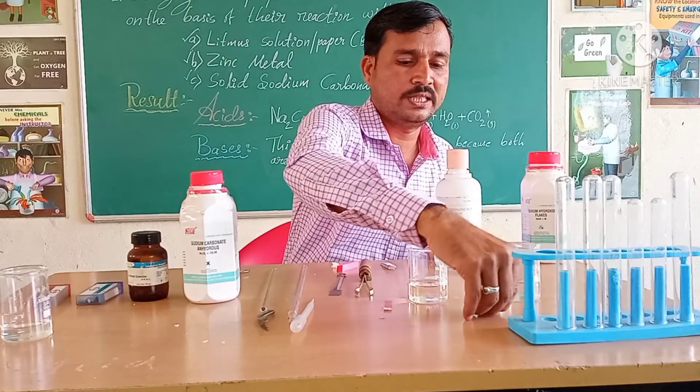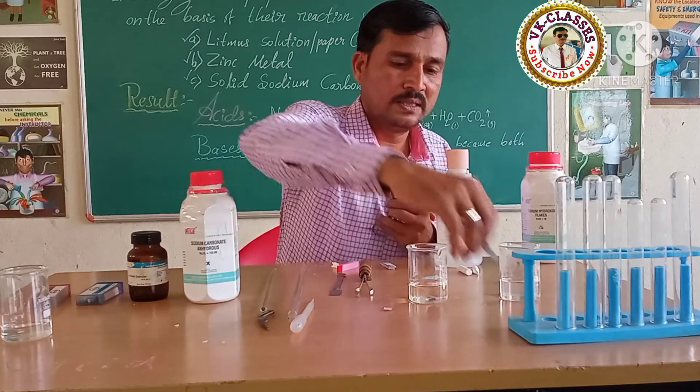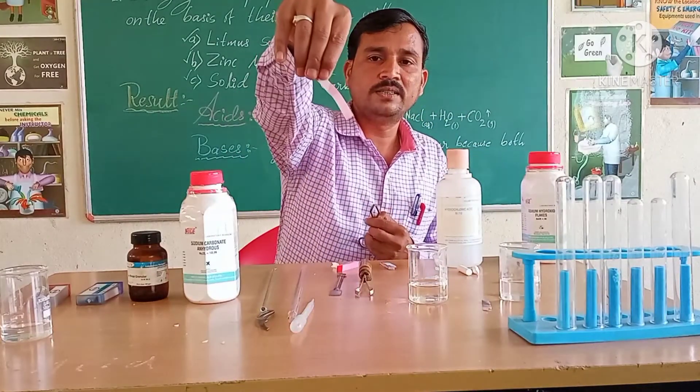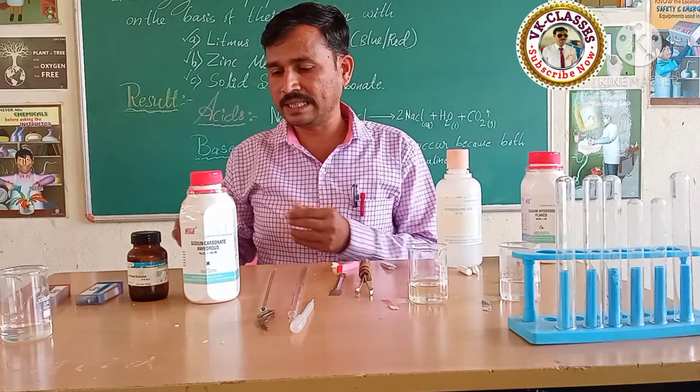Here is the clear observation: acid changes blue litmus to red, and the base changes red litmus to blue. You can see it one more time — completely changed. So, the first property we studied successfully.